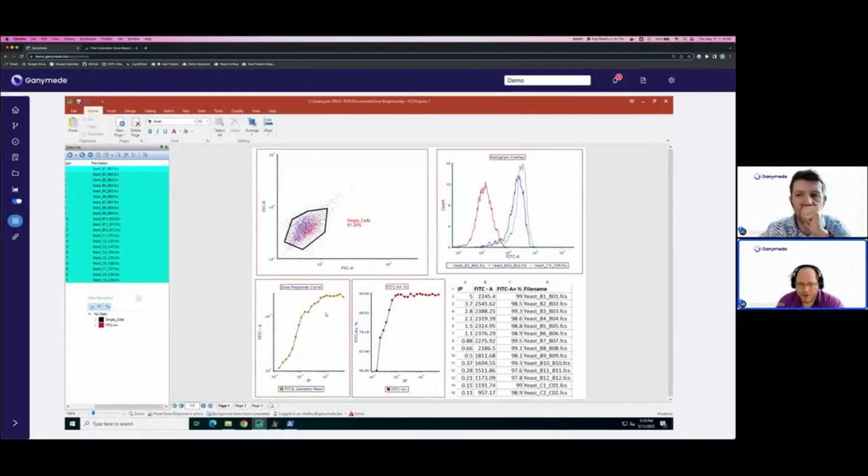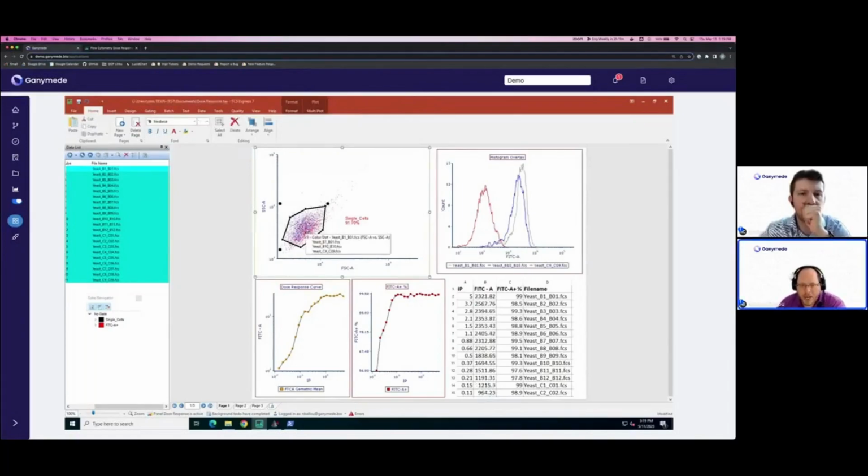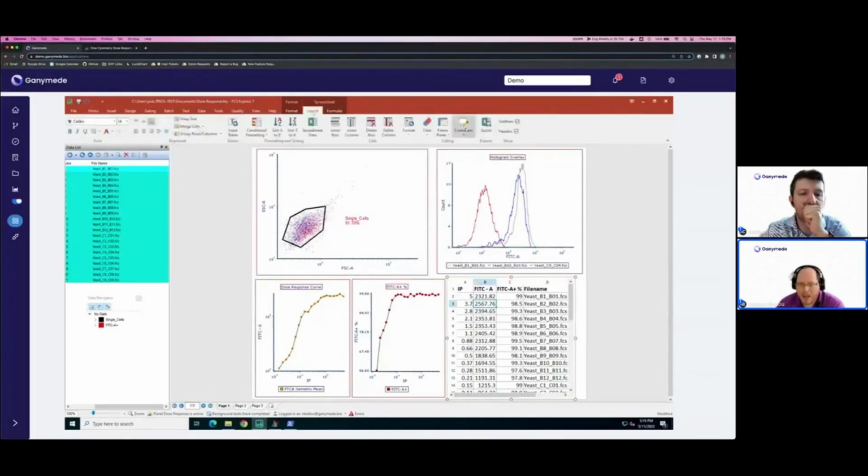So this is all great. We've got all the data. We're doing the manipulation in this virtual machine. But what do we do when we want to get the data off and do some additional processing? Well, that's when agents come in. So we've got this machine connected to what we call an agent that allows it to automatically take, for instance, an export file from this virtual machine and run some additional processing on it.